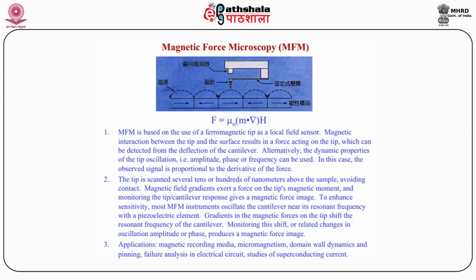Magnetic force microscopy is a variety of atomic force microscope where a sharp magnetized tip scans a magnetic sample. The tip-sample magnetic interactions are detected and used to reconstruct the magnetic structure of the sample surface. Many kinds of magnetic interactions are measured by MFM, including magnetic dipole-dipole interactions. MFM scanning often uses non-contact AFM, abbreviated as NC-AFM, mode. Magnetic force microscopy. This gives a mathematical relationship and shows in what way the tip scans the surface and these forces are measured.